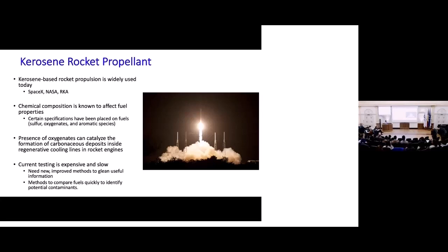To do that, we have to have a lot of specifications on things such as polar compounds, sulfurs, oxygens, nitrogen compounds, etc. Without monitoring these, they can lead to very high buildup of carbonaceous deposits in jet engines, and that can lead to very low thermal performance.